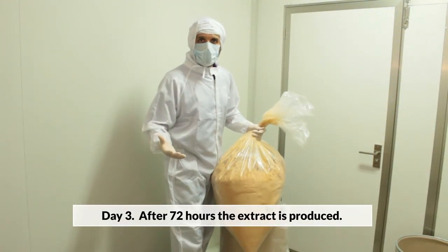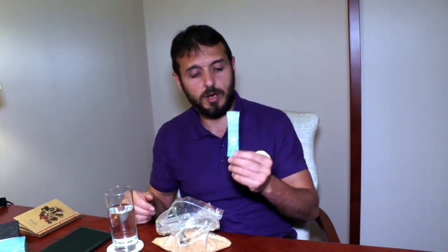After the spray drying process has finished, all our extract powders have been arranged into 25 kg bags. It took just over 72 hours from the time when we fed the raw material of our shiitake into the extraction system, till the moment when we actually started getting the first bits of spray dried extract. It's absolutely worth investing all the time and effort into producing this beautiful, high potency extract from the organic material. It's got a really distinct shiitake flavor, nice and smooth taste, really potent extract. This is how we actually get our products — this is where Nutri Fungi's potent organic extracts actually come from.